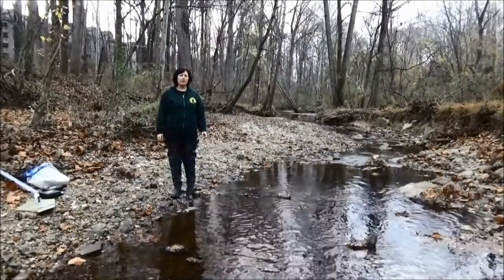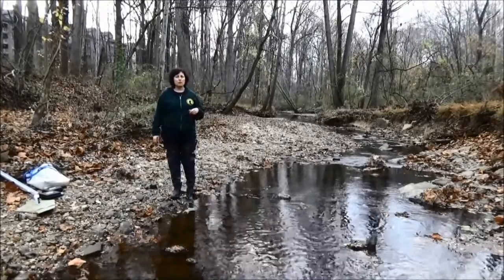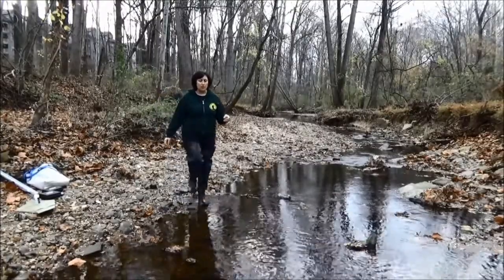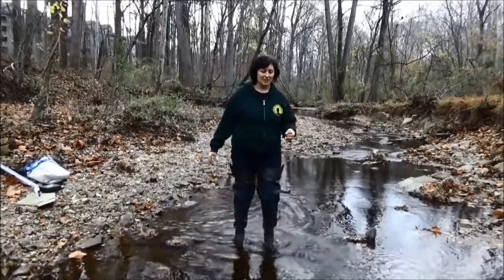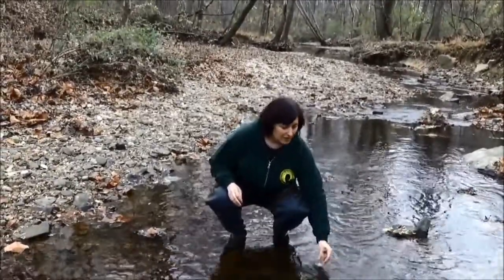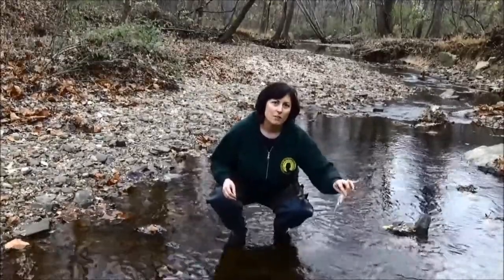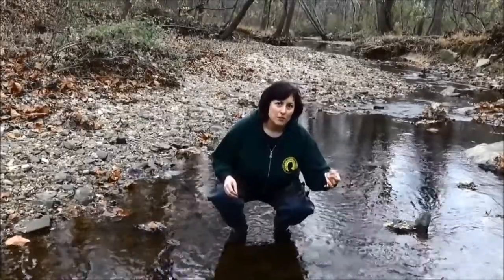So the first thing we're going to do is rinse out your vial. We're going to take our sample from the middle of the stream, and you always want to make sure that when you're monitoring, you start from the downstream and work your way up so that you're not disturbing your site before you take your sample. We're going to rinse out our sample vial three times by filling it with the stream water and pouring it out, so that we make sure we're actually testing the water in the stream and not the tap water that you might have used to clean your vial in between samplings.